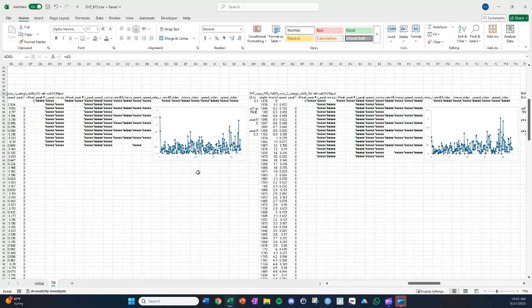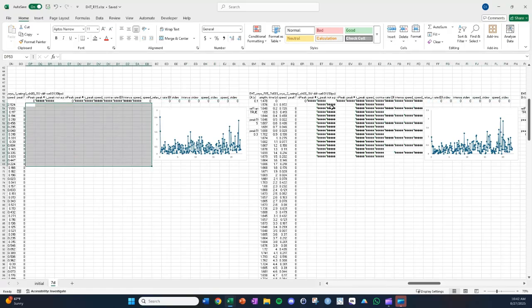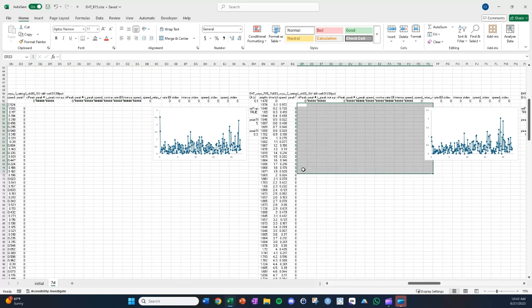But when it's kind of crazy and jumbled like this, this is data that I always just process like this, where I just zero this out. And yeah, we can get rid of all of this, not needed.